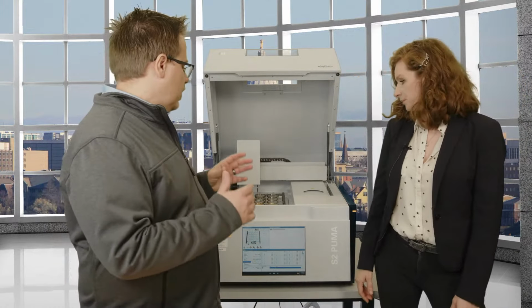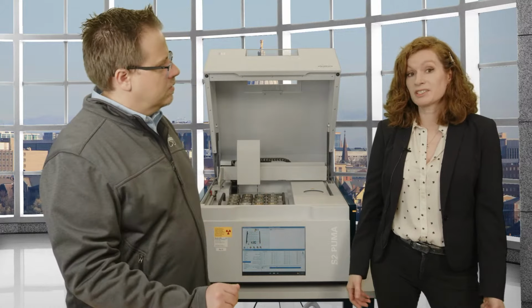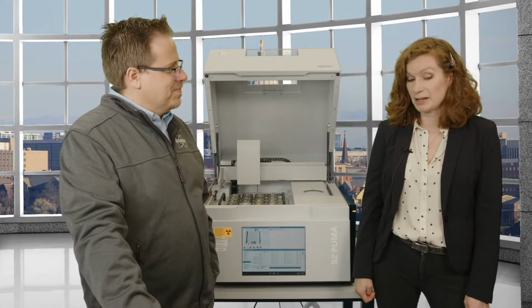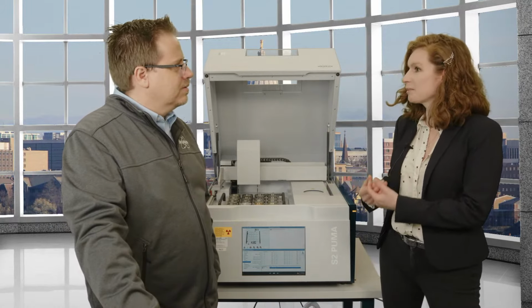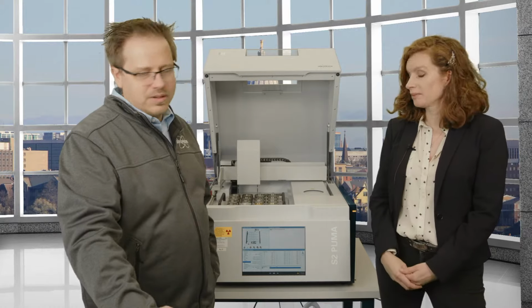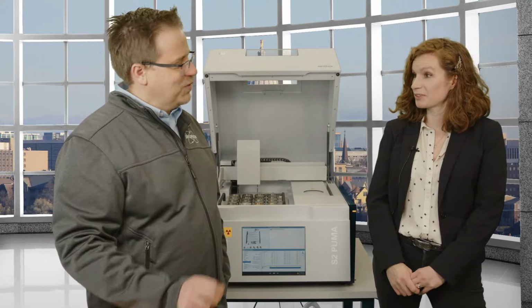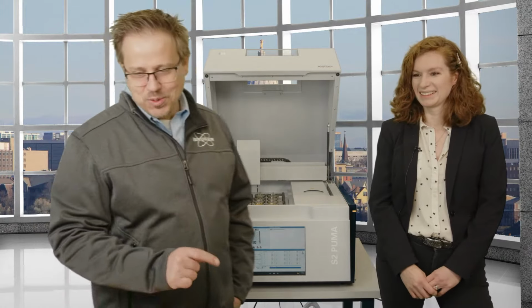And so how much does sample prep influence that precision? Well, if your sample prep is repeatable, that's great. If it's not repeatable, like with my cookies, right? I don't have a very repeatable sample prep. Then your outcome differs. Okay. And it looks like the company that made these store-bought ones has a much better homogeneous batter than I do. They're very good at sample prep, right?